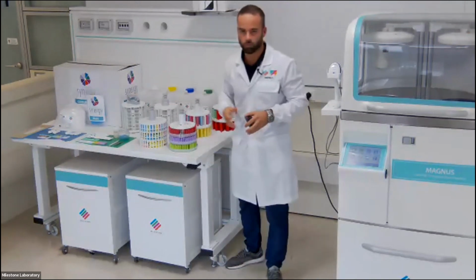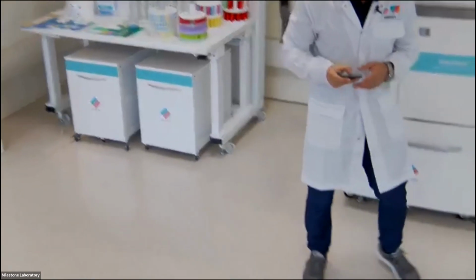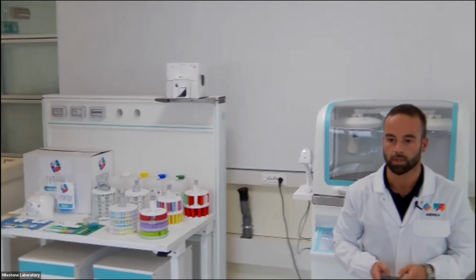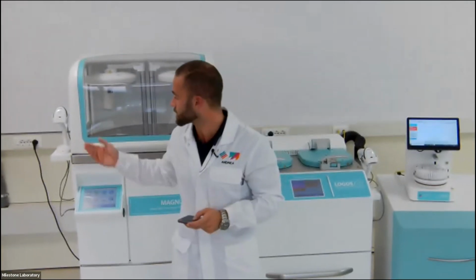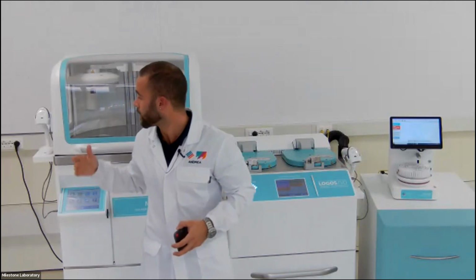And so it depends on laboratory needs. So this is how many cassettes it can handle. Obviously, if you manage to work with Magnus or Logos Evo in dual mode, you can use 2 racks, so double the number of cassettes at the same time.